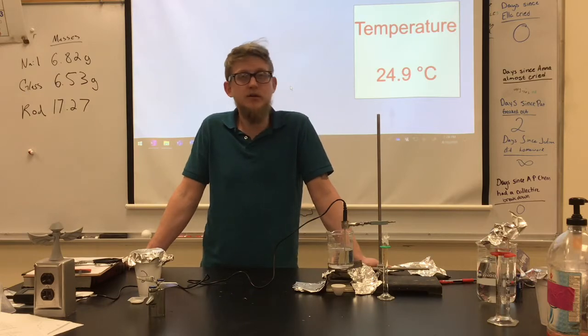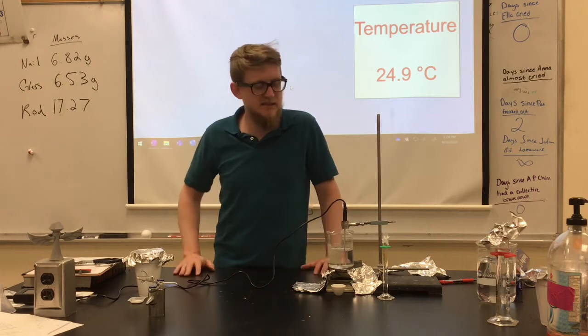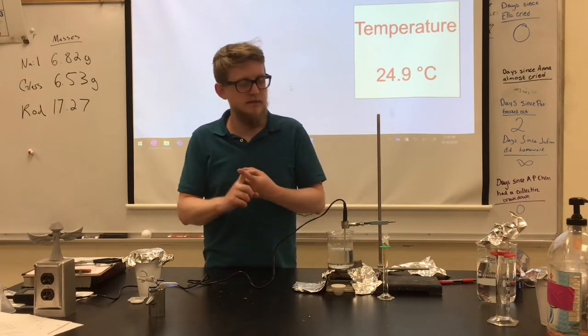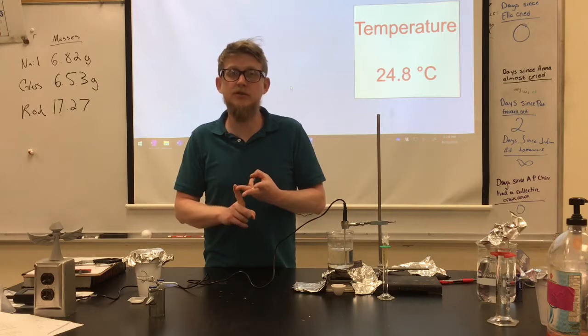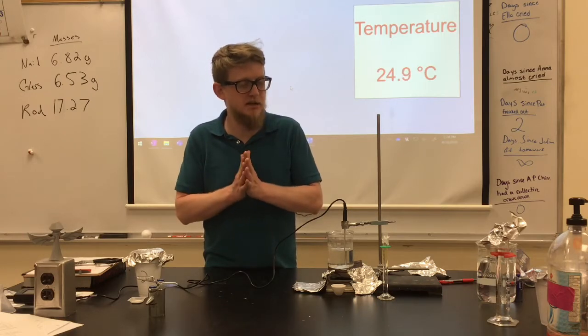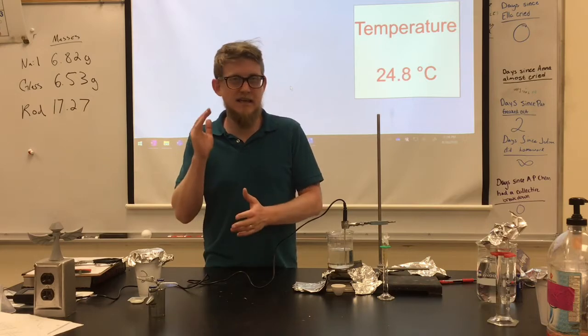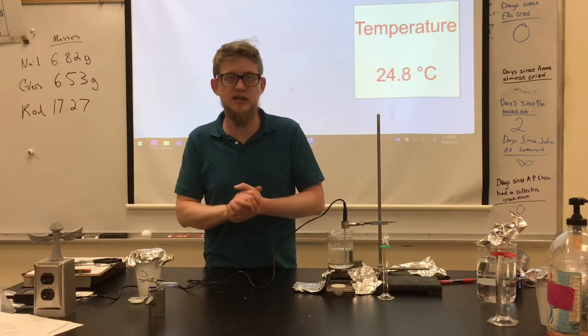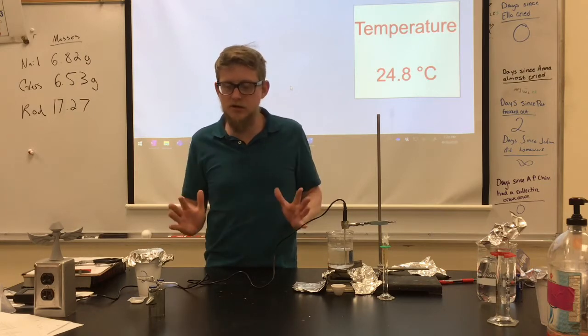In this lab we're going to do 3 experiments where we measure or investigate the heat of combustion, the heat of solution, and the heat of neutralization. Okay, so we're going to be measuring or manipulating delta H in these reactions, which is the kilojoules or the energy involved in a reaction per mole of the reaction. Okay, so that's what we're doing right now.